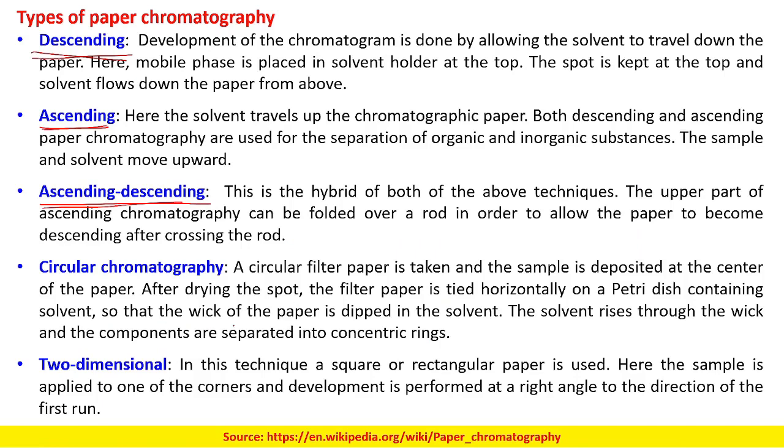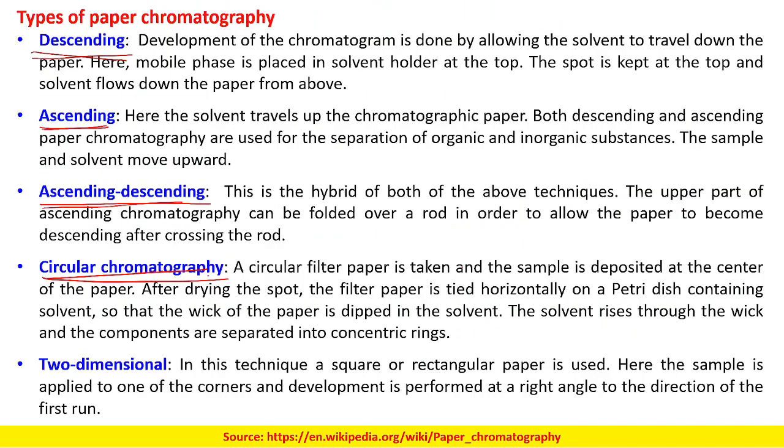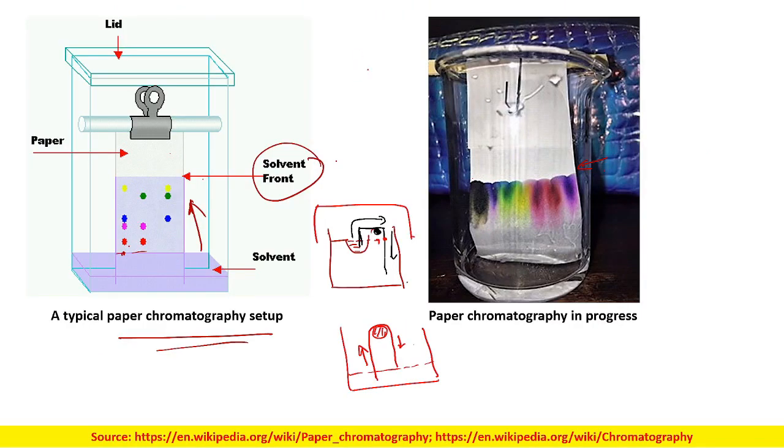Okay. Then we have circular chromatography. In the circular chromatography, I am talking about the top view. At the center you will be putting the drop, and this drop will be moving in all the directions. So how will the setup look like?